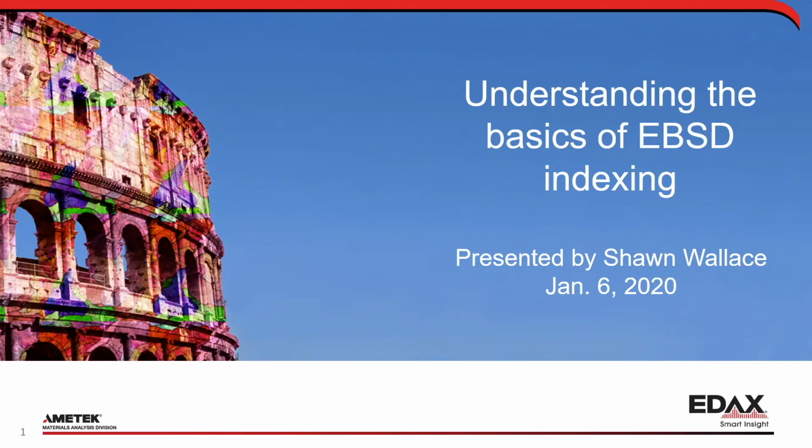The first talk today is going to be understanding the basics of EBSD indexing. I think it's important to understand how an orientation is figured out from the EBSD pattern. If you understand how it happens, how we actually get the orientation, it helps you troubleshoot if something does go wrong, and it also helps you have more confidence in your data, because it's no longer a black box. It's no longer, "Oh hey, EDAX says this is the orientation I have." Instead, it's going to be, "Oh hey, this is the orientation I have, and here's why I'm comfortable saying this." I'm going to talk about this in detail, about patterns and pattern quality, and go from there.